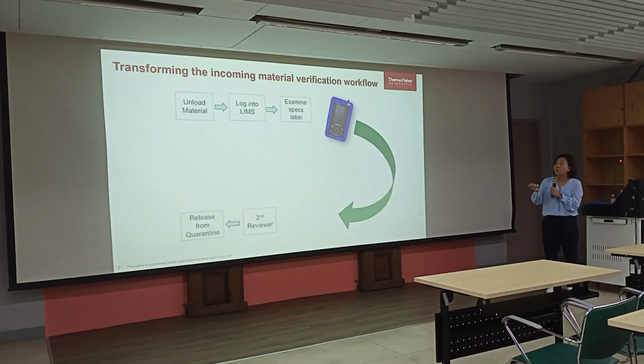Now I want to verify the raw materials, whether what I received is correct. Because sometimes the label is acetaminophen, but when I check the raw material, the result is failed. Why? This is the ibuprofen, so actually they're sending the wrong raw materials. With the handheld instrument, you can speed up the process and reduce the analysis time.